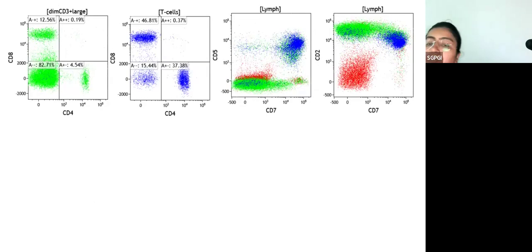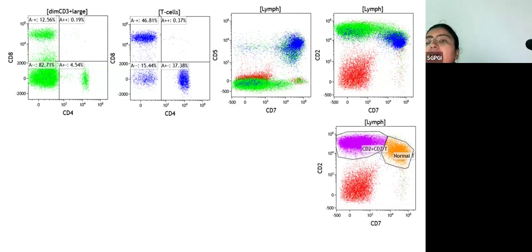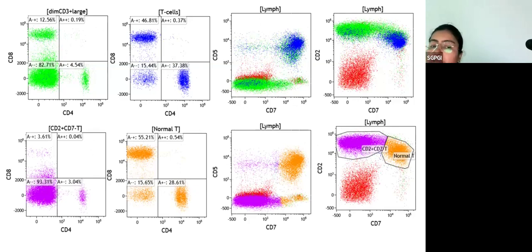You look at the CD2 expression. CD2 in the normal cells is here and your green cells, they are all over on the top. CD4 and CD8: in our CD3 positive large cells, majority of cells are CD4 and CD8 negative, while our normal T cells show this nice normal kind of a split. With respect to CD7 and CD5, the green cells, they were dim CD3 positive and they were large in size. You see that they completely nearly lack CD7 expression. Very few of them express a dim CD7, while they are very bright for CD2. Based on the CD2 and CD7 expression, we can separate these populations further: CD2 positive, CD7 negative cells and the normal T cells.